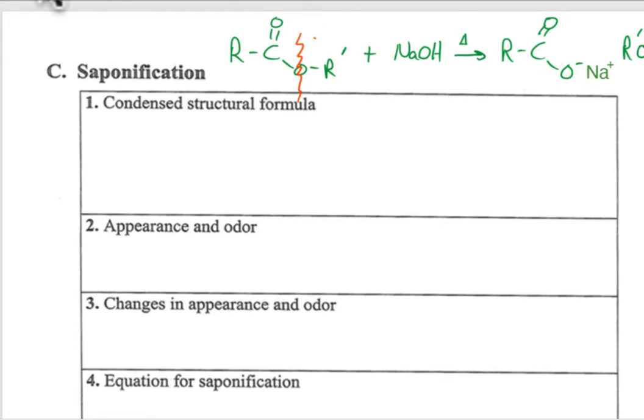So this thing is oftentimes soluble. Like I said, we're starting with a clear and colorless solution, and we wind up with a clear and colorless solution. That's because the product formed here is an ion, and it's just soluble in that solution. So again, you don't see any changes. That's why I'm not showing you the heating step for this part.